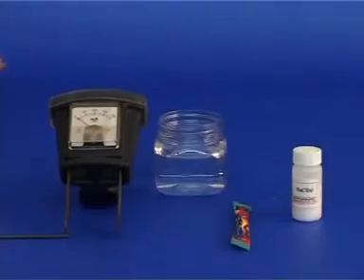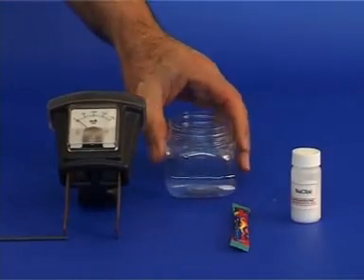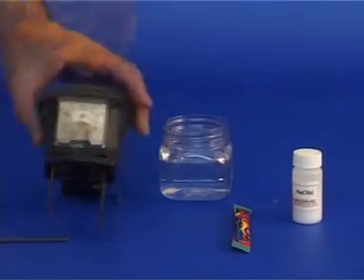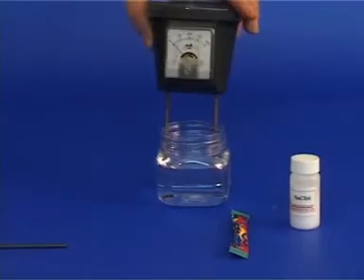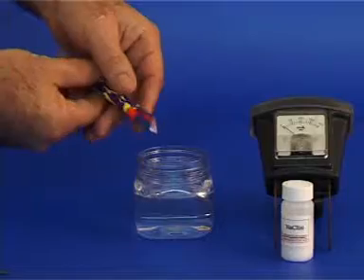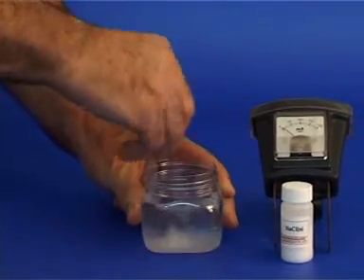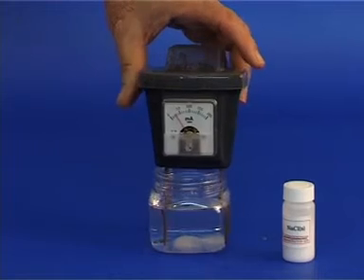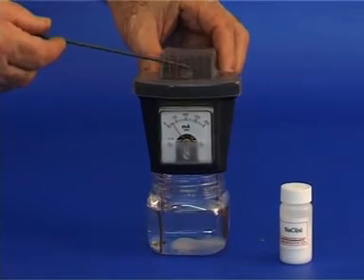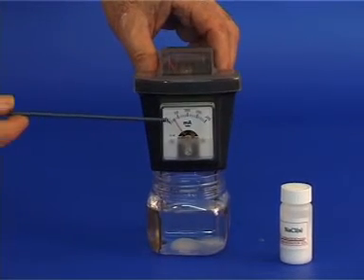We shall repeat the last experiment using the other conductivity device. Measure the conductivity of tap water. Add the sugar, stir and observe the conductivity now. The bulb does not light up and the reading is the same as with the tap water.